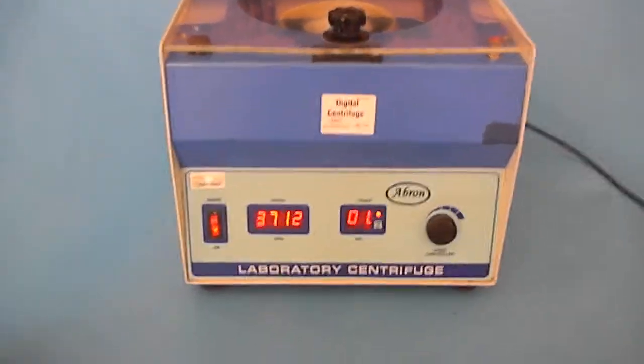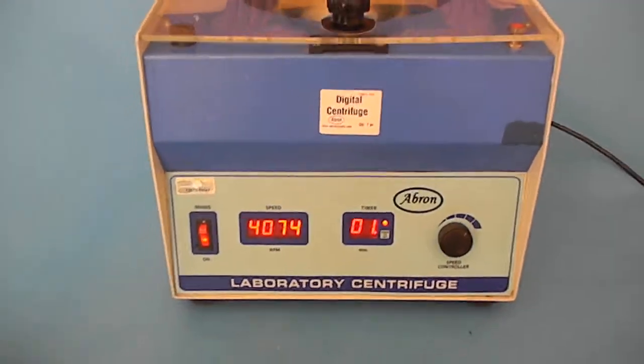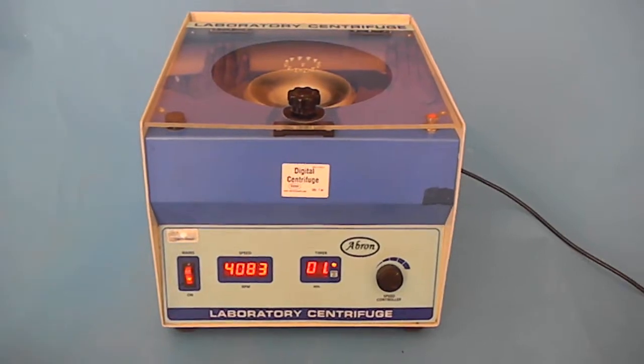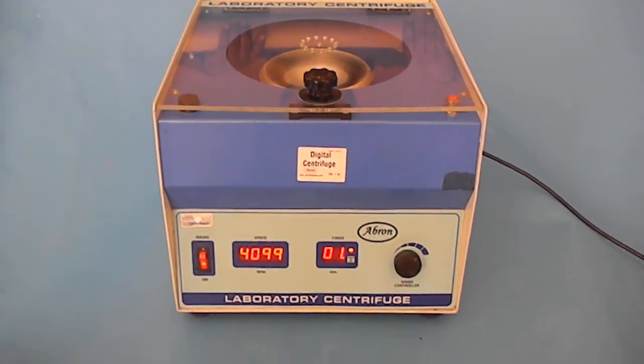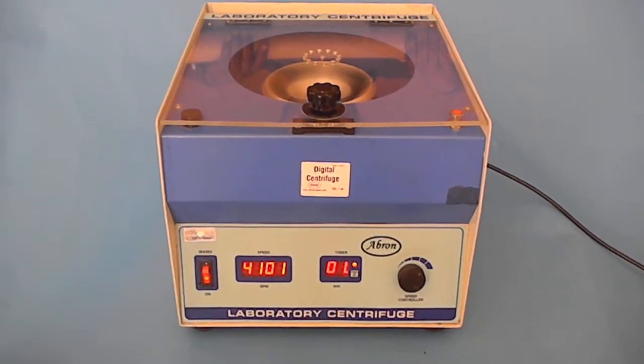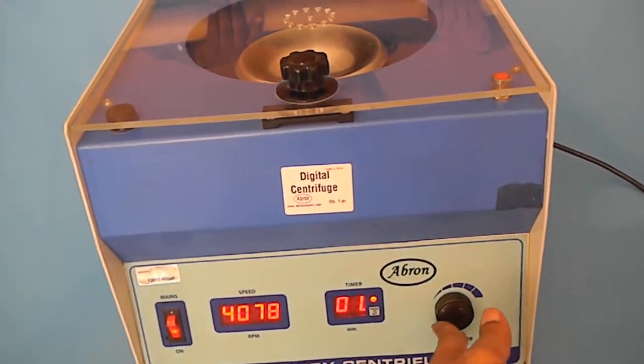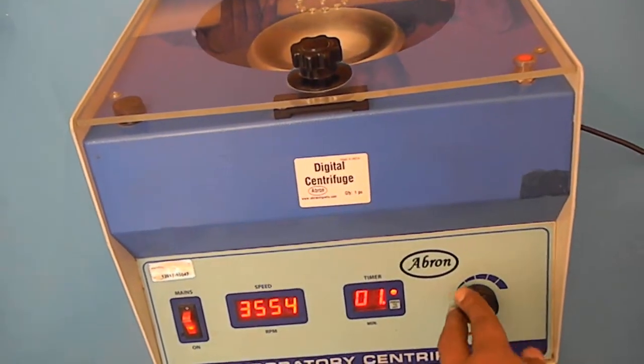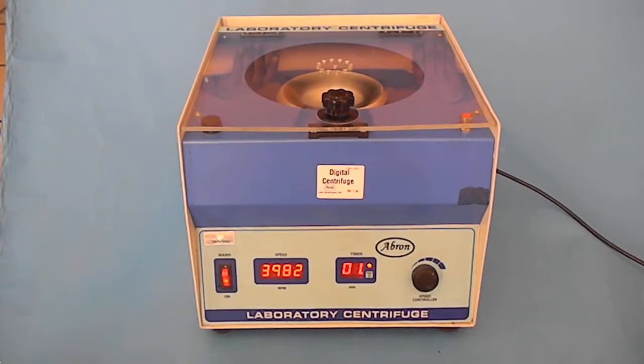The timer is running and the RPM is going up. This is 4000 RPM with a one minute timer. If you need to stop anywhere, you can turn it back to stop it, or it will stop automatically after one minute. The timer is going on.